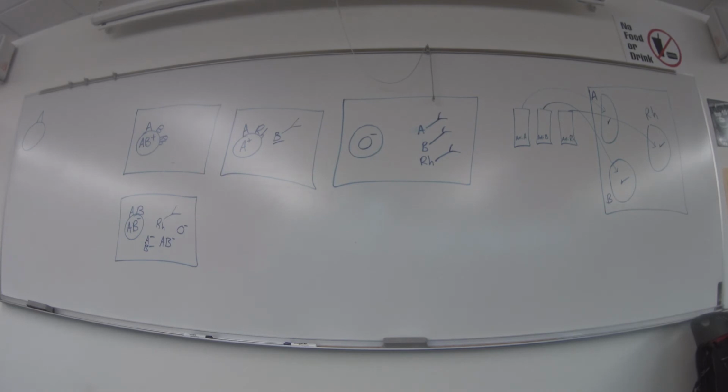I want to mention one more thing about the blood slides, about the microscope work you guys are going to be doing today. Oil immersion is an option. Most of you have done this before at least once in Biology 112 or in microbiology many times. So oil immersion is only for the maximum, the largest lens, that we probably, hopefully never use because it doesn't actually help you unless you use oil. This lab is always written as if people are going to use immersion oil all the time.